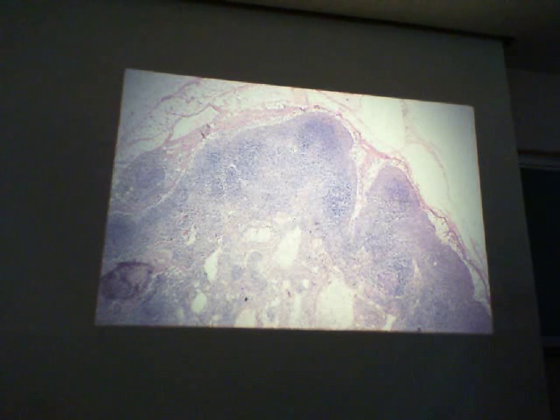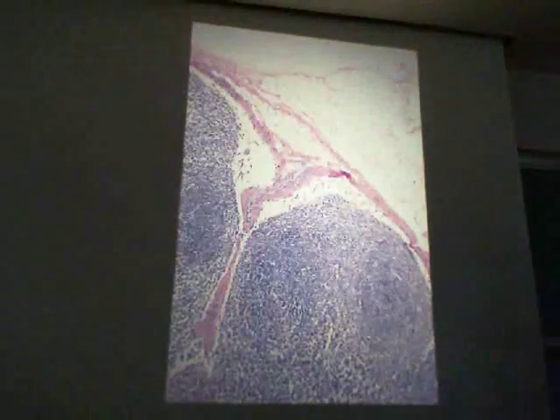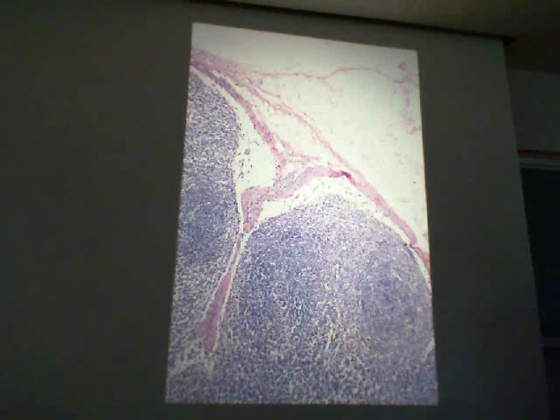And how about that tissue right there and right there? White fat. Oftentimes there'll be fat associated with these lymph nodes. Okay, and the same thing right there. Nice trabecula coming down. And in actual fact, when you look at these paraffin sections, there is some shrinkage that actually accentuates those and makes those easier to find. But they are there. And this organ.